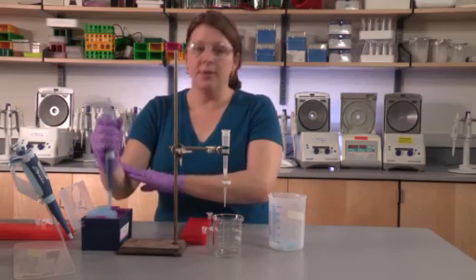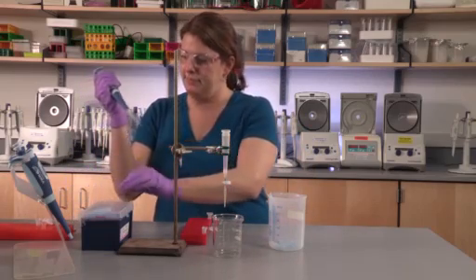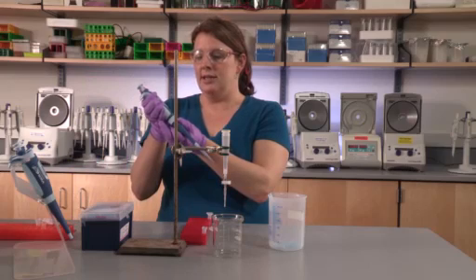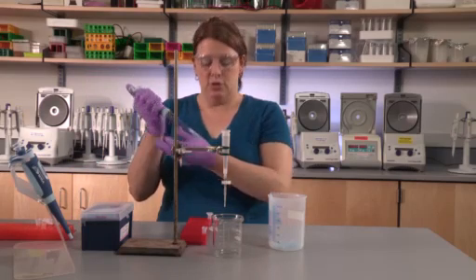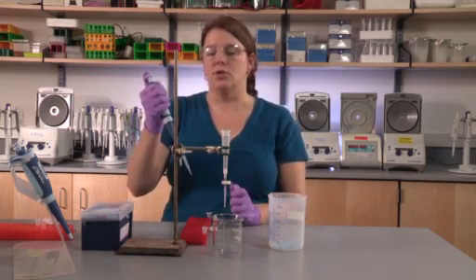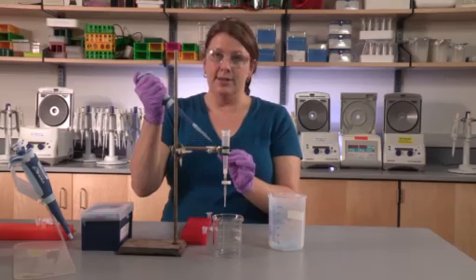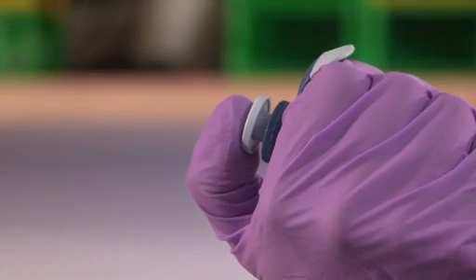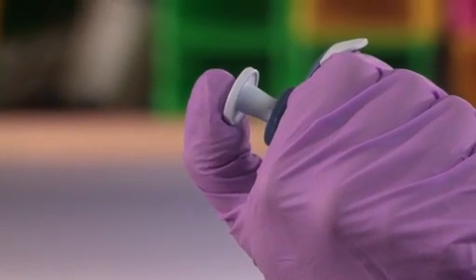Place a pipette tip onto the end of the pipette. Be certain that it's set to 1,000 microliters or 1 mL. Use your thumb to depress the plunger and draw up the first mL of elution buffer.